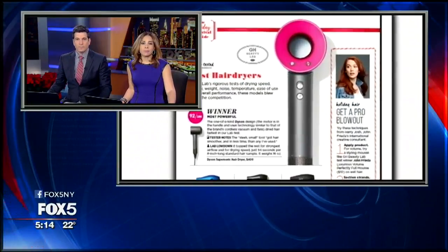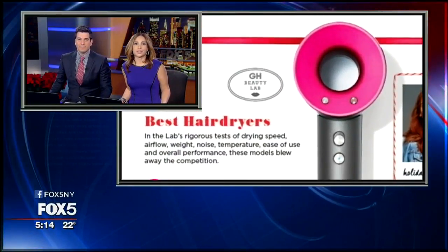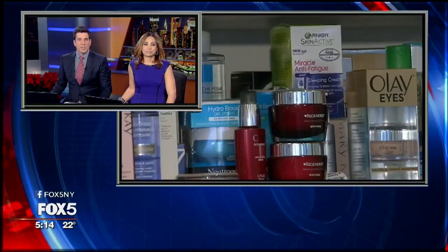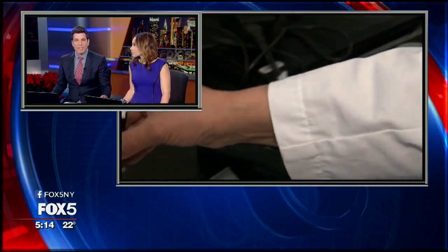So tonight we are going back to the Good Housekeeping Institute to check out the Health and Beauty Lab. All right, Alison Morris here now to show us how cosmetics, creams, and more are tested to get the Good Housekeeping Seal. This is so huge because you have no idea what's in the bottle beyond just fancy packaging. Especially when it comes to health and beauty, because we don't have a lot of regulations here in the U.S., so you really kind of need an extra set of eyes looking out for you to check on those ingredients.